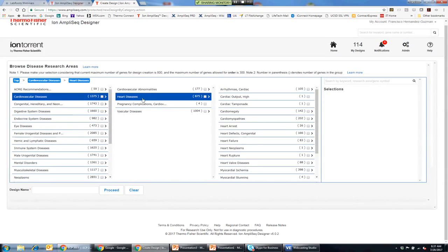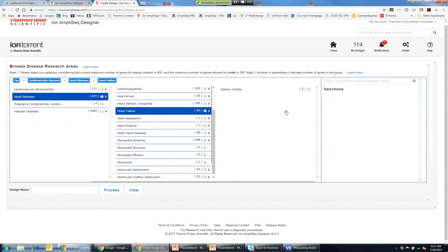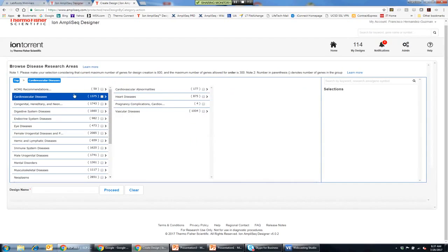It goes down into, maybe let's say I'm interested in heart diseases, I come down to that. And let's say I'm interested in heart failure, I can go down to that level, and then select subcategories within those areas.